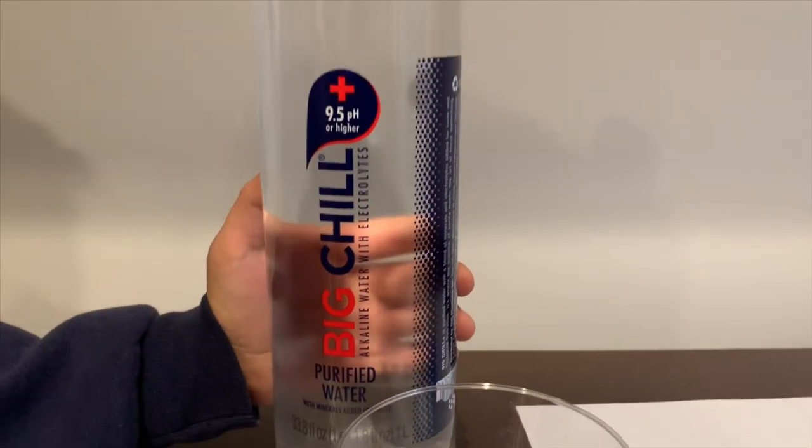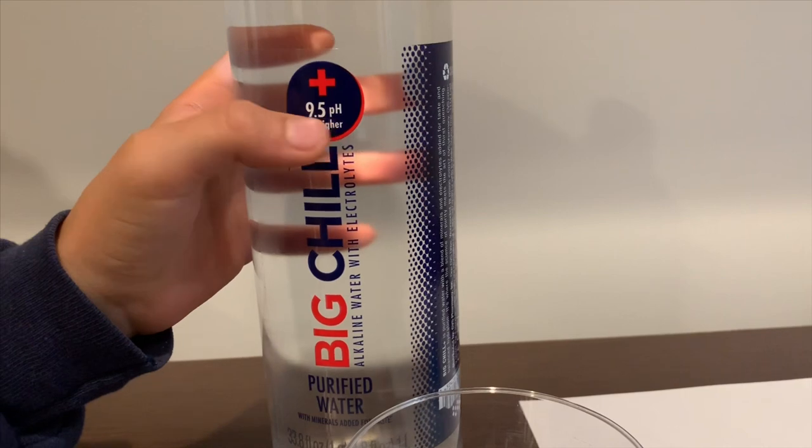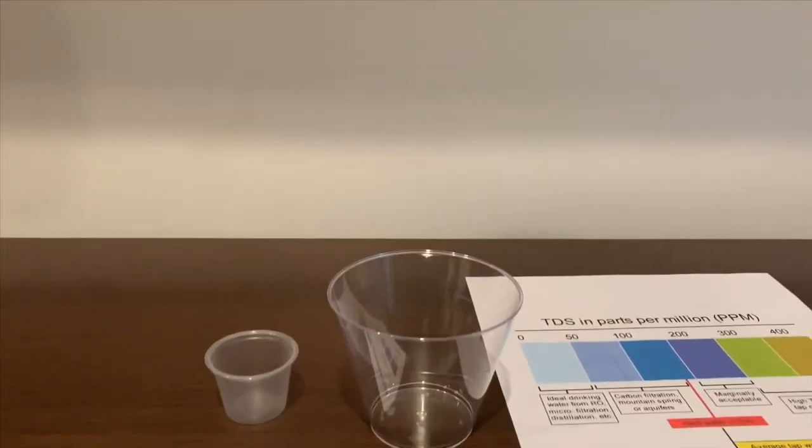Today we show purified water with electrolytes. It says the pH should be 9.5 or higher. Let's test the pH and TDS levels. It costs $2.19.